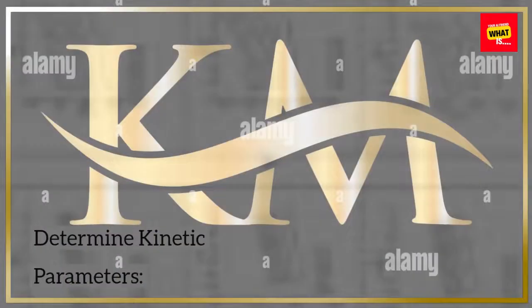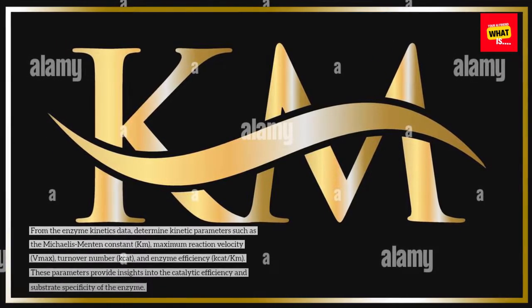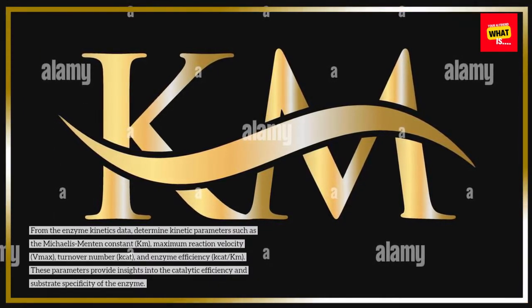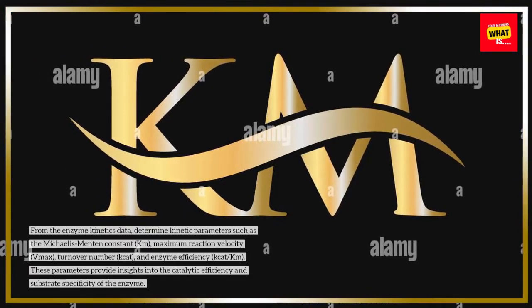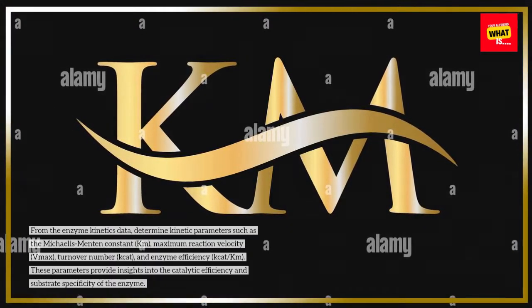Determine kinetic parameters. From the enzyme kinetics data, determine kinetic parameters such as the Michaelis-Menten constant, Km, maximum reaction velocity, Vmax, turnover number, kcat, and enzyme efficiency, kcat per Km. These parameters provide insights into the catalytic efficiency and substrate specificity of the enzyme.